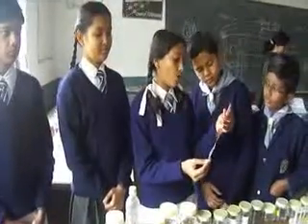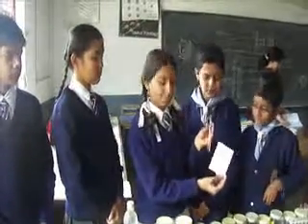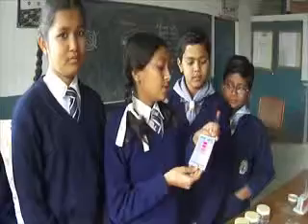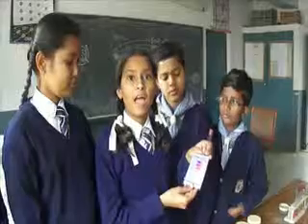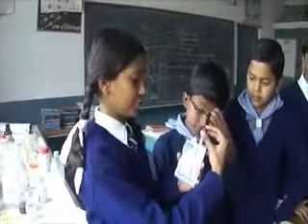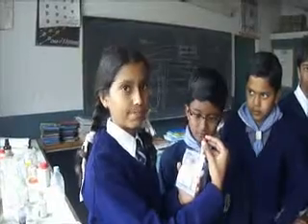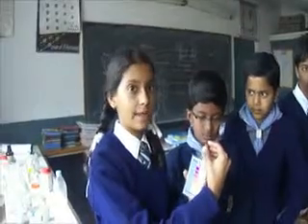Then we will notice a change in the color of the water sample. Now we will compare it with the chart which is given to us. It is observed that the water sample contains 1.5 mg per liter, which is a permissible range. By the same procedure, the sample collected from Shiv Colony, Guna, Madhya Pradesh has 5.0 mg per liter fluoride, and it is not a permissible range. It can be dangerous for our health.